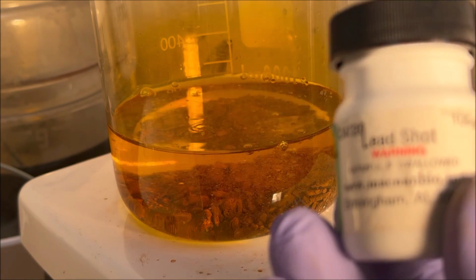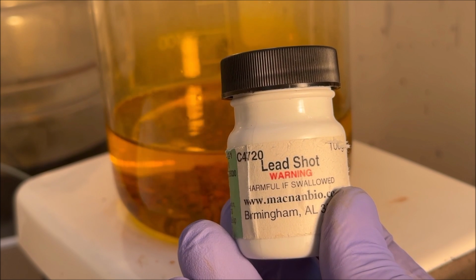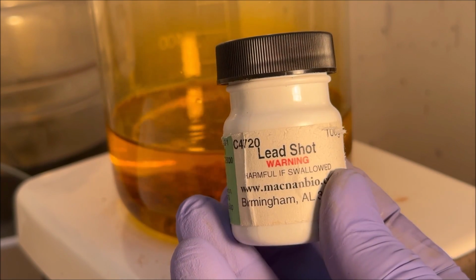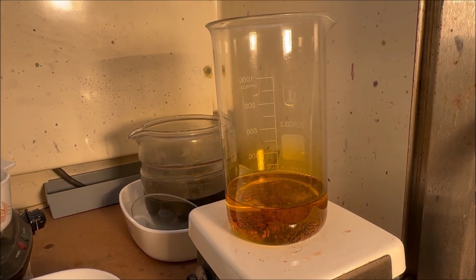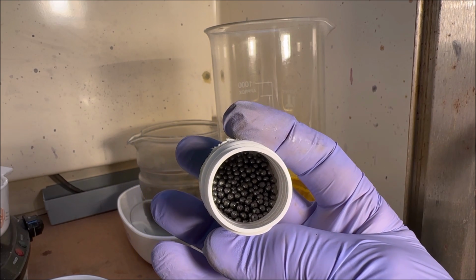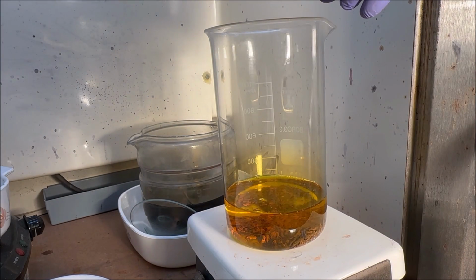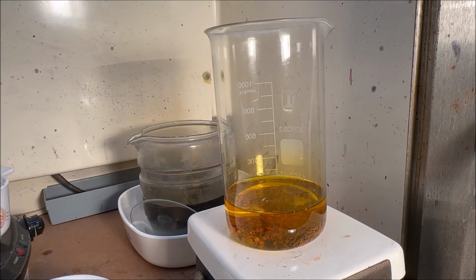That's because there's some residual nitric acid in there. And so what we're going to do with this experiment is I've got some lead shot here, and I think what we'll do is add a few pieces of this lead shot into here as we dissolve the gold. I don't know how this is going to work or what it's going to do. I'm just going to put a few pieces in here. That's about maybe 5 or 6 pieces, 7 or 8 maybe.